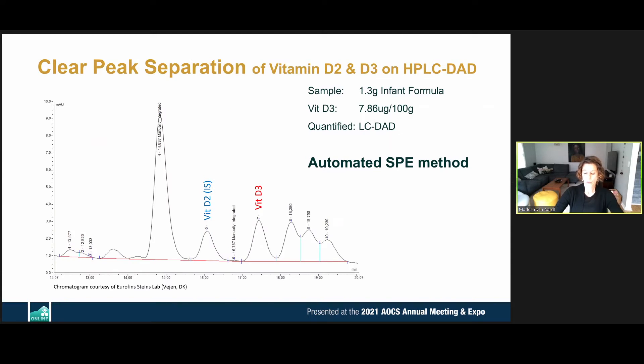For vitamin D analysis, most customers use mass spectrometry for detection, which gives a very low limit of quantitation and is easily detectable. But even customers running HPLC with UV detection can clearly see the peaks on an approximately 1.3-gram infant formula sample at 7 micrograms per 100 grams, distinguishing the vitamin D2 internal standard peak from the inherent vitamin D3 recovery.